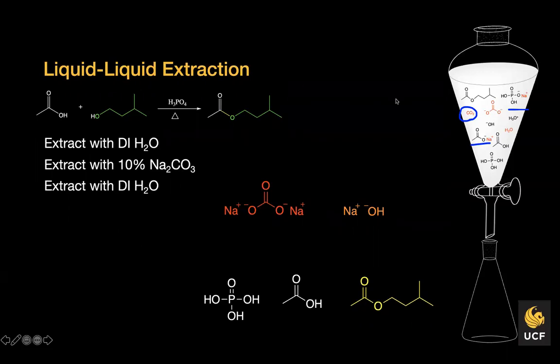I was going to do a poll, but I won't. All right, could you guys type yes or no on the chat? Could we use sodium hydroxide instead of sodium carbonate, so basically water in the presence of some base, sodium hydroxide? Anyone?